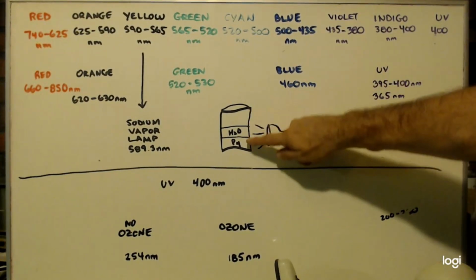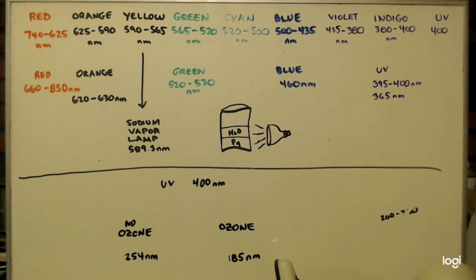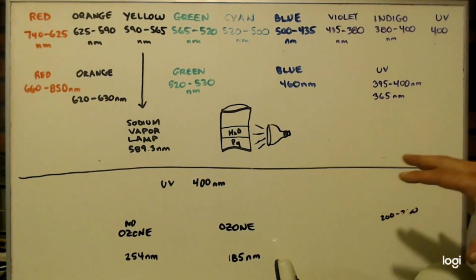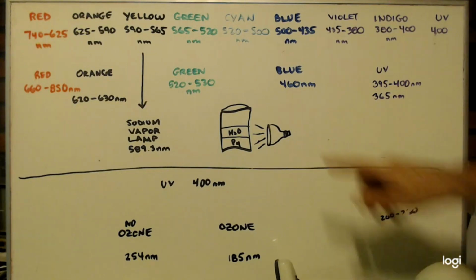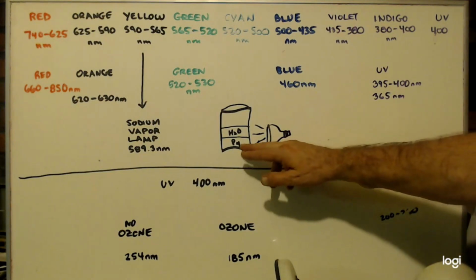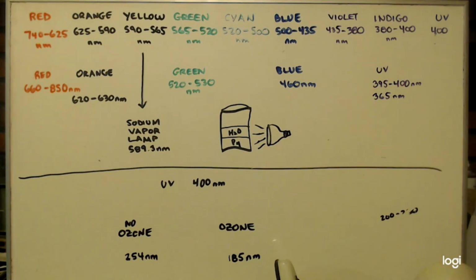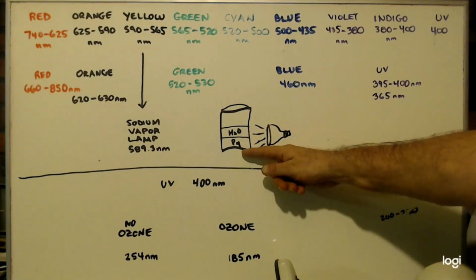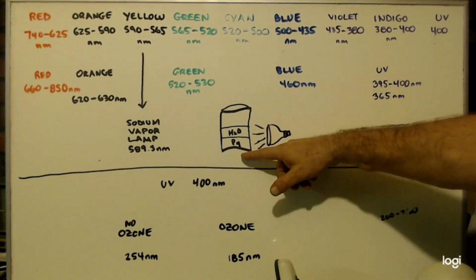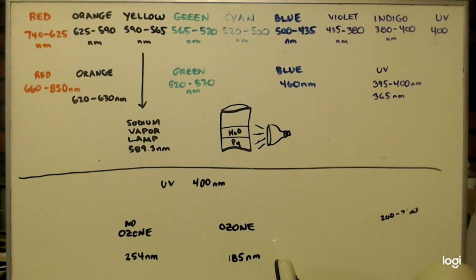Okay, let's say you have a cup and you have your white phosphorus and you have your water on top so the phosphorus doesn't touch the air. You heat it up to 50, 60 degrees Celsius. The phosphorus melts. It stays on the bottom of the water. You shine your light on it, your ozone light, and it should break the phosphorus-phosphorus bonds out of that P4 to make red phosphorus. Red phosphorus is a solid, so it falls to the ground, and eventually all the liquid white phosphorus will turn into solid red phosphorus.